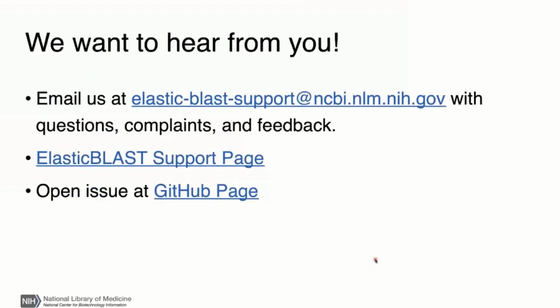Finally, let us know how this works for you. We are actually excited to hear from you. Let us know if you find a problem so we can fix it. I've listed an email address here, but you can also open an issue on our GitHub page. And so that's it for me, and I guess I'll turn it back to Peter right now, to see if there are any questions.